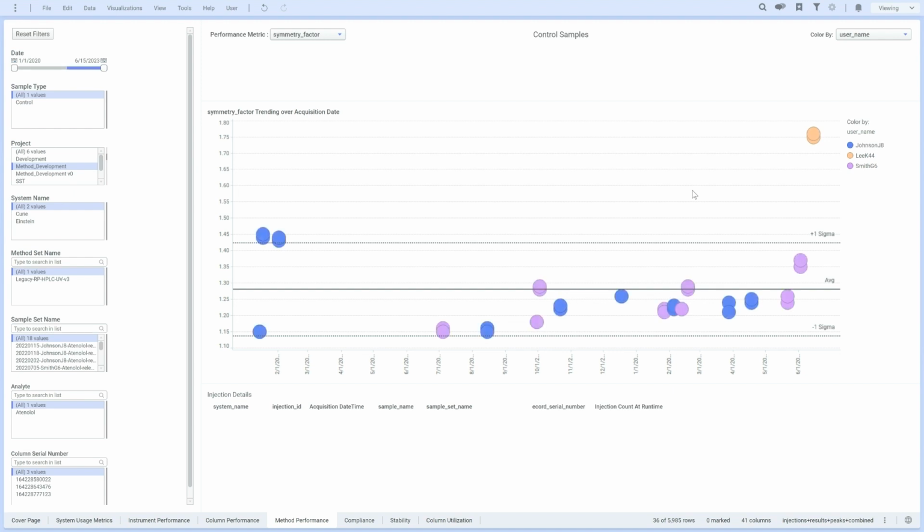By using this dashboard, we are quickly able to survey the complex landscape of chromatography data analysis and zoom in on the most common culprits of method performance issues, namely instrumentation, columns, and analysts. The data suggests that one of the columns may be approaching end of life, and ordering a replacement would be best practice as part of a risk mitigation or continuous improvement strategy.